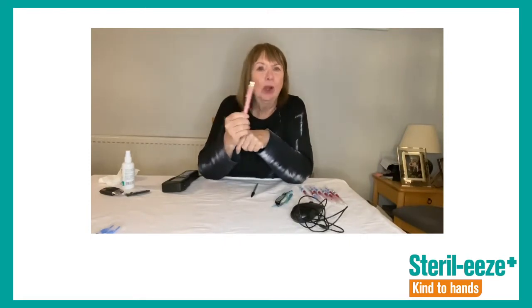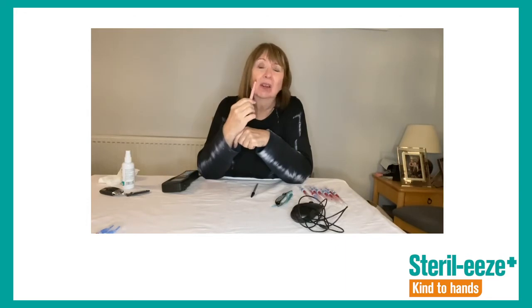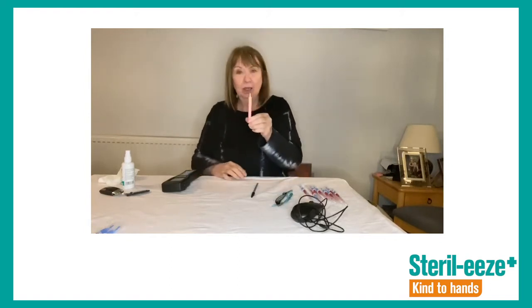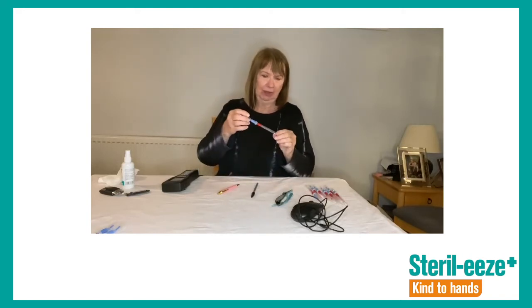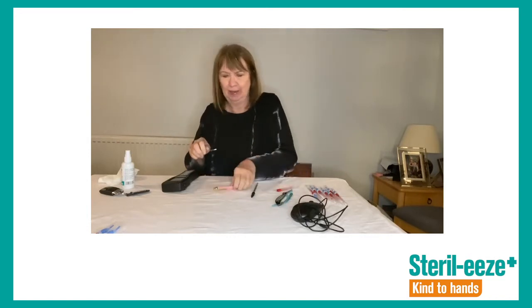So let's have a look at pens. Everyday objects. What do we do with pens? Shove them in our mouths a lot. Lots and lots of people pass them from one person to another. Everyone borrows each other's pen. So do we clean pens? Can't remember the last time I cleaned a pen. So let's just see how many organisms are present on this pen.